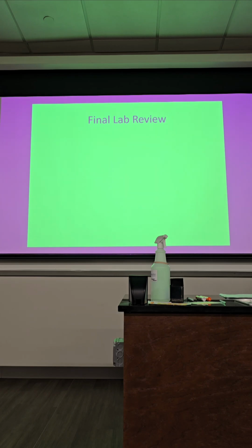Okay, all right, so I have to give the disclaimer. In no way is this actually the test. It's not a replica, right? So this has to be used in conjunction with your lab list. I don't think I have any respiratory slides here, but by Friday I'll probably add some more slides to it, okay?